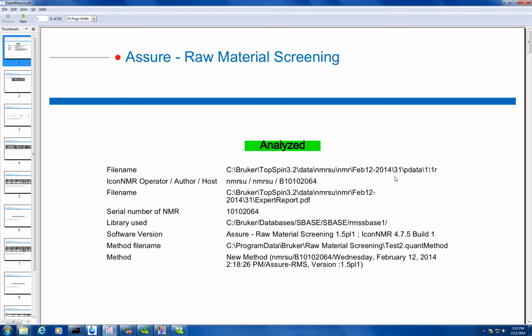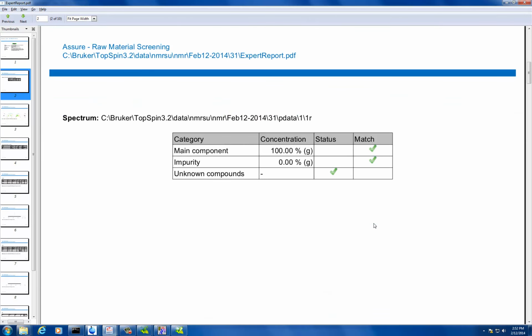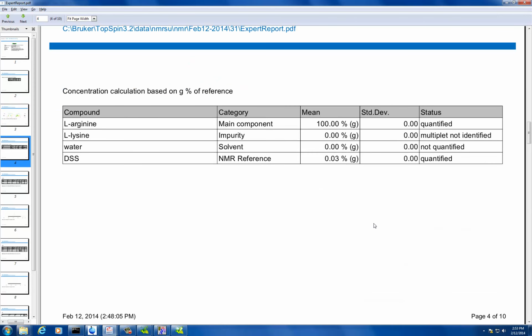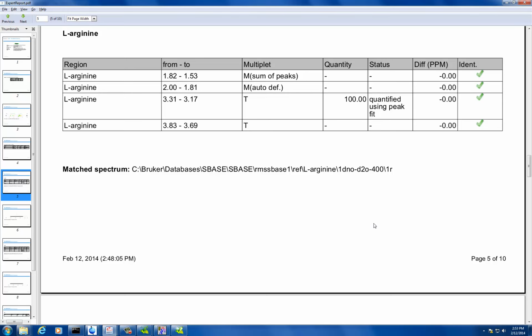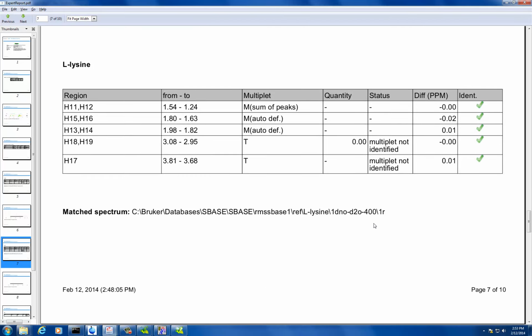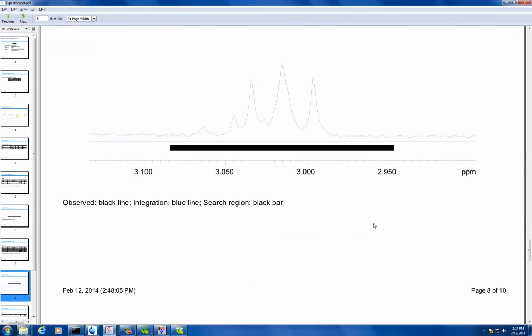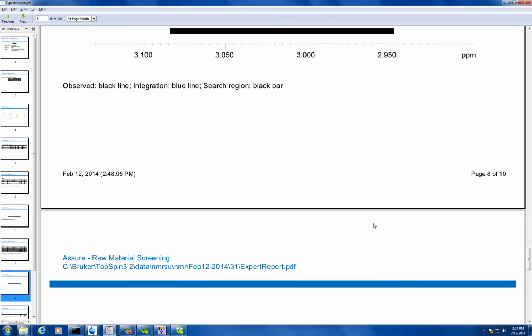Scroll down. Okay, let's go down. Why didn't it identify it? That's interesting. It identified arginine, which we obviously know it would. The triplet was not identified, so let's go down. I guess if we make our own data, that's the way to do it accurately, right? Yeah, that's the thing. That's a concern. You would need to.